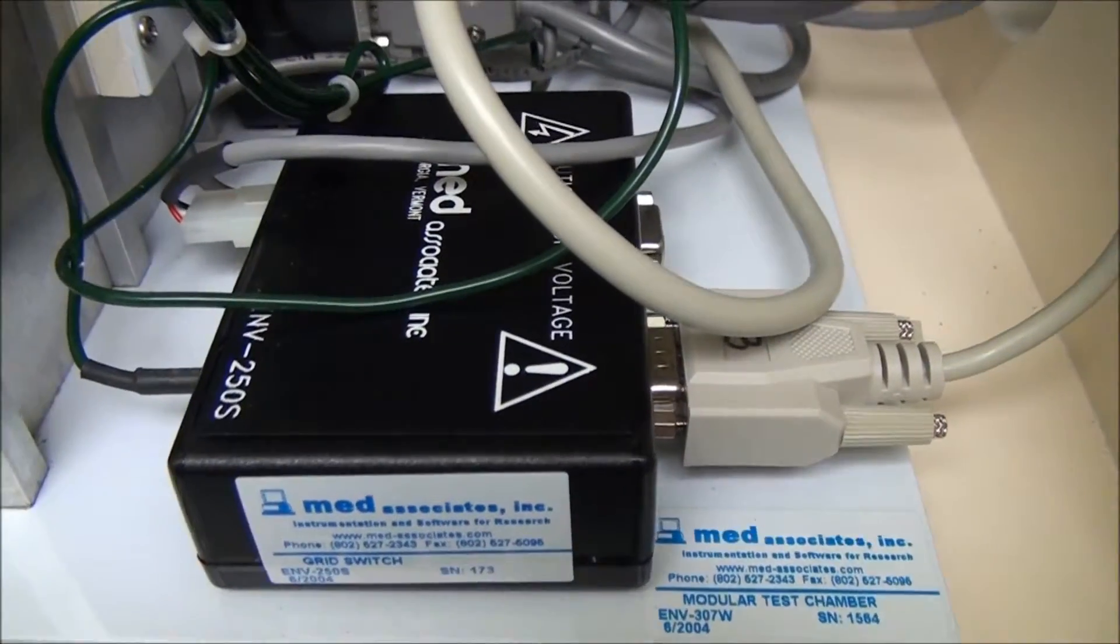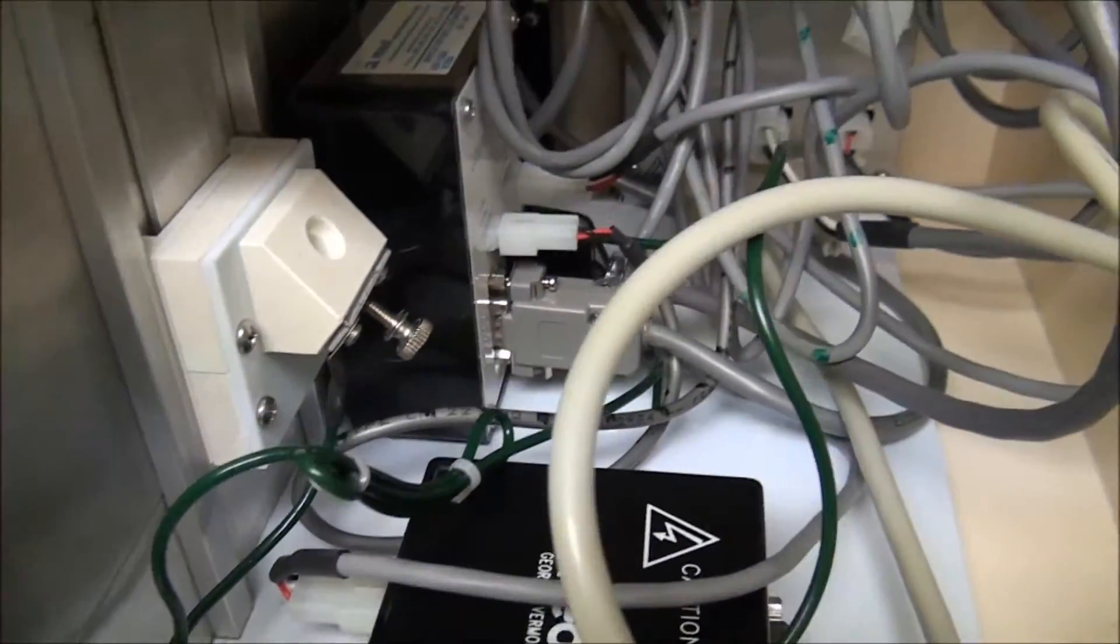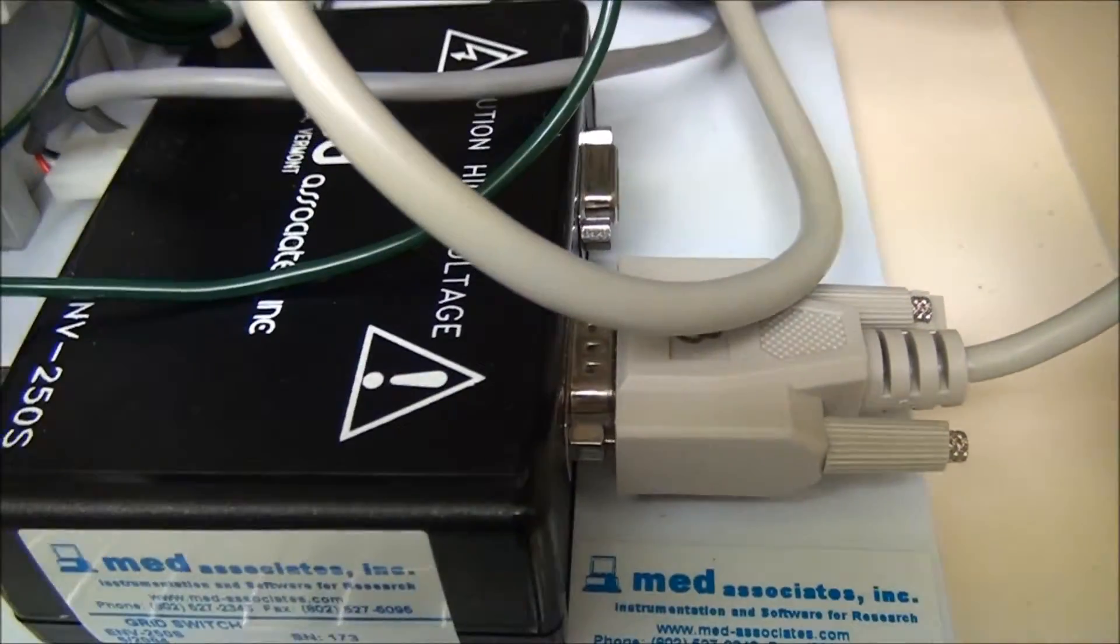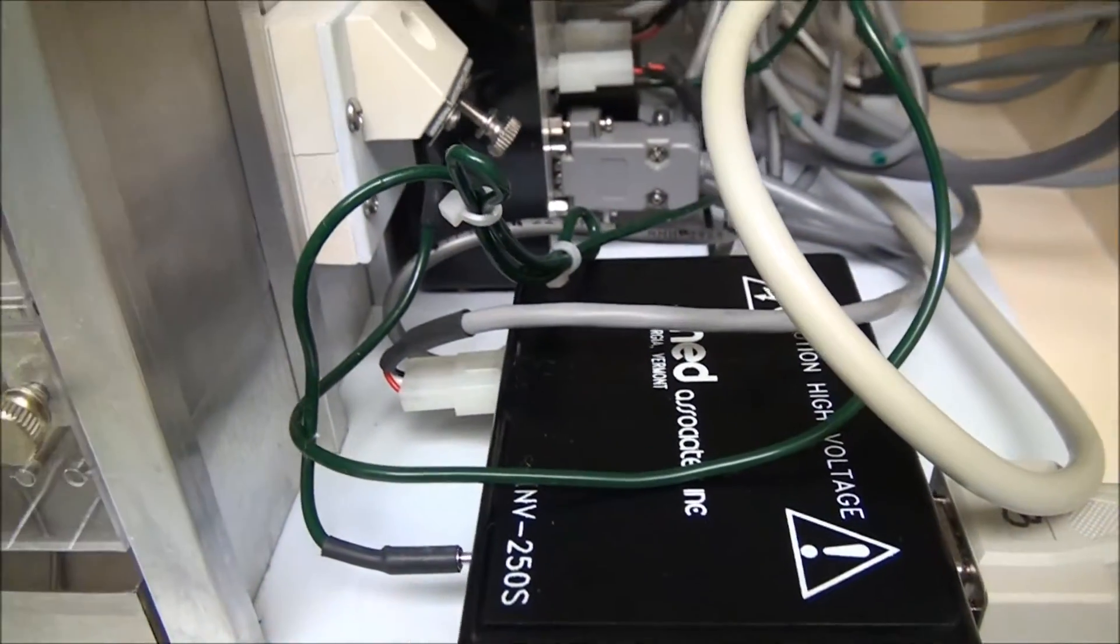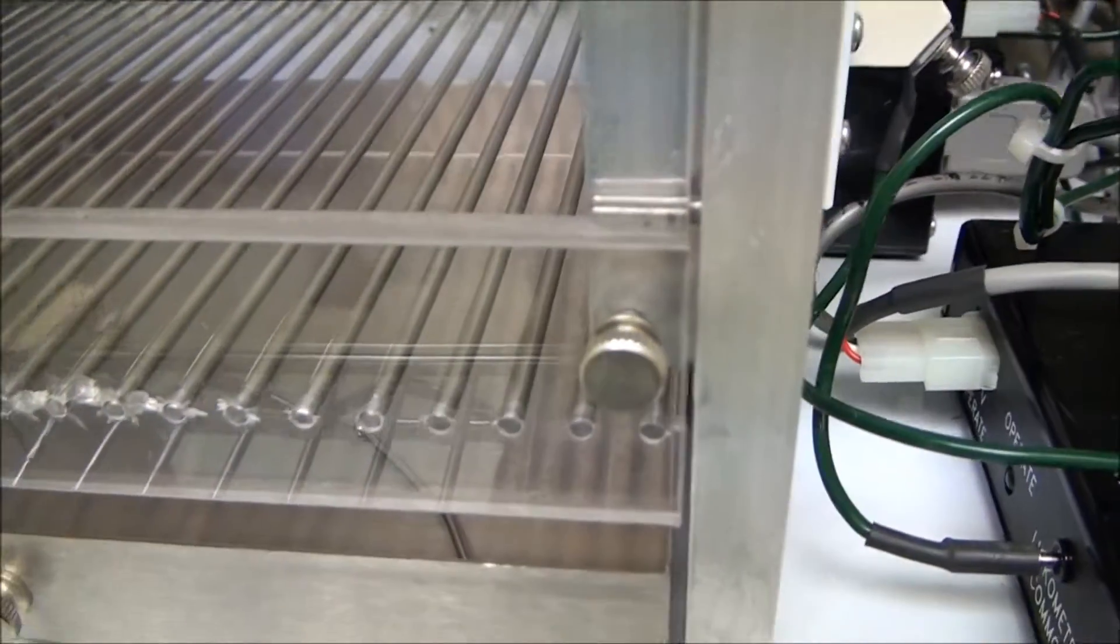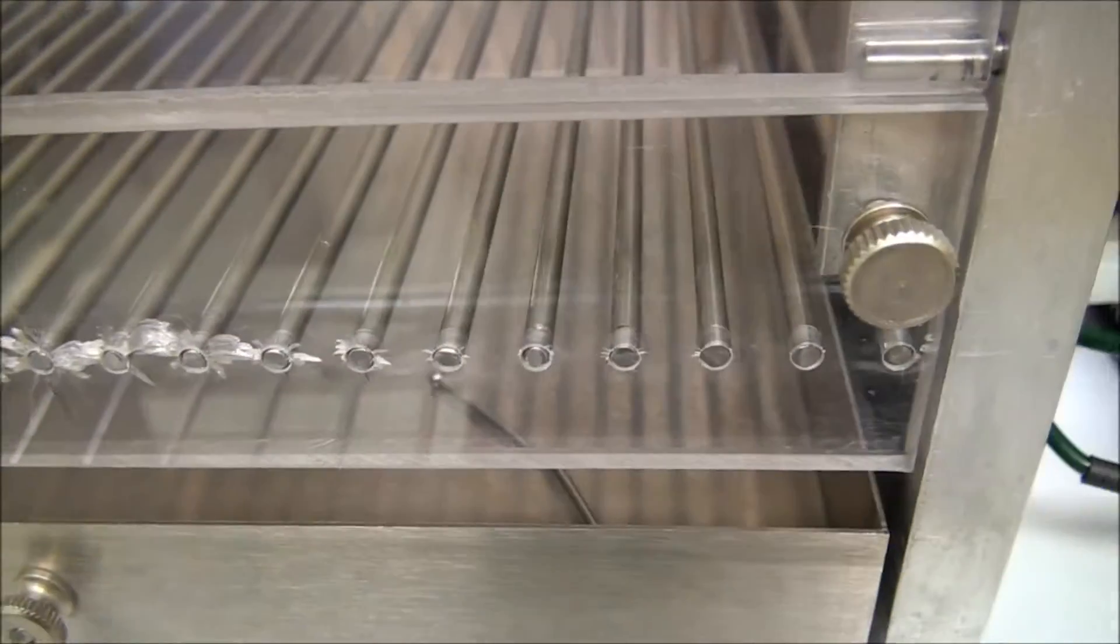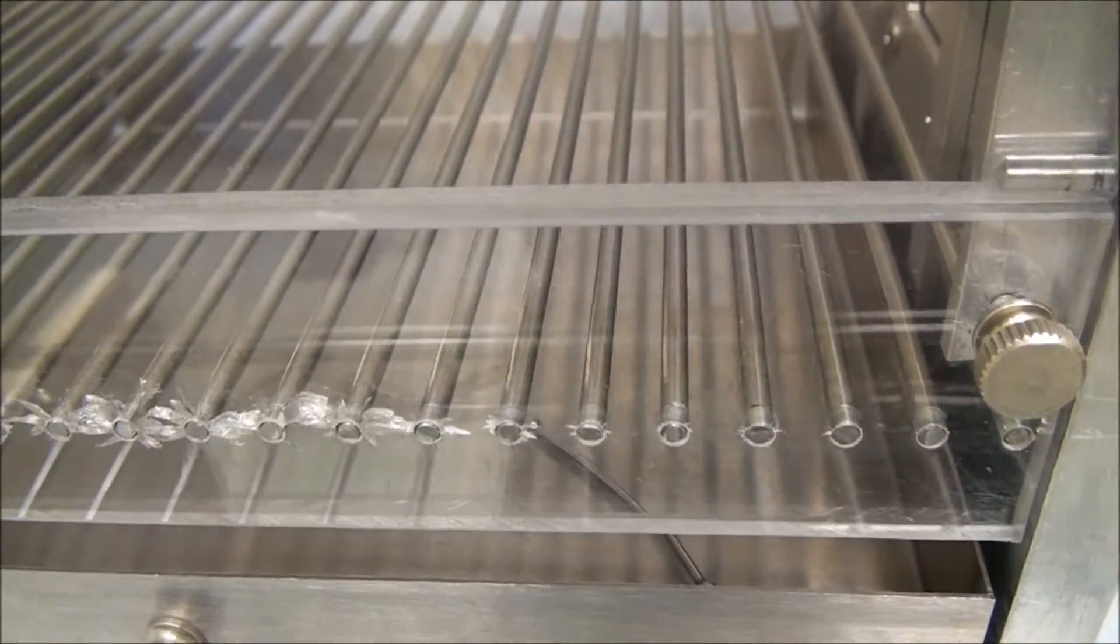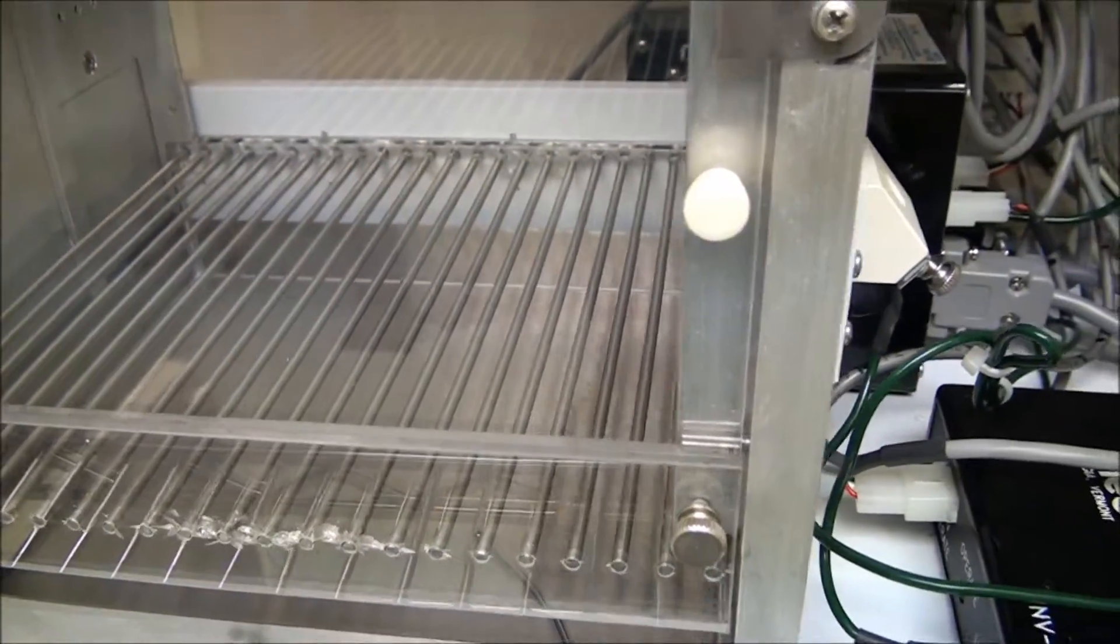And then the other module over here is a bit different. It's actually a module that you would have to unhook the Licometer module that we just showed you and then rewire it for this. And this module is a Scrambler grid module where it takes each individual grid on the deck here. And you can program it to shock any of these rods on this grid. And then that's why they call it the Scrambler.